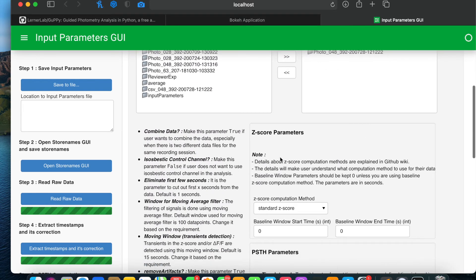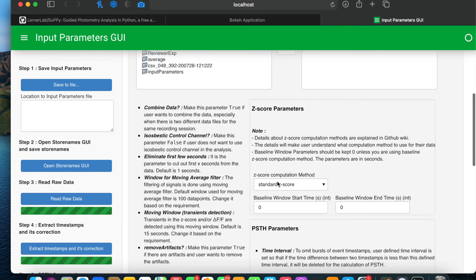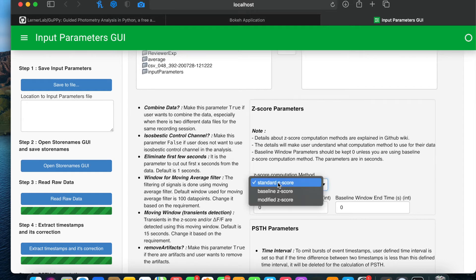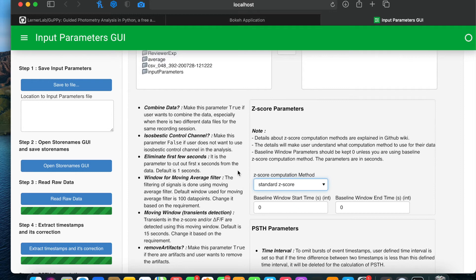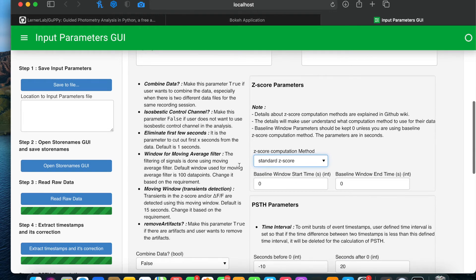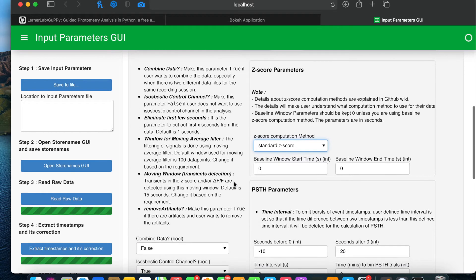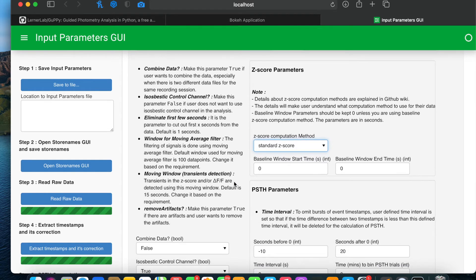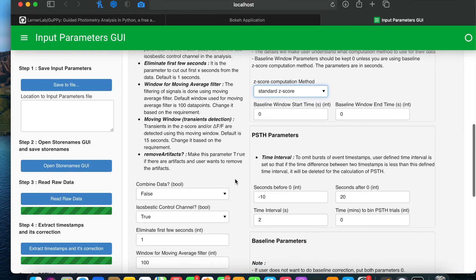There are Z-score parameters with three different computation methods to calculate Z-score: standard Z-score, baseline Z-score, and modified Z-score. For details on how these methods work, visit the GitHub wiki page.